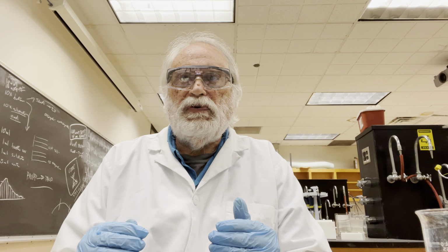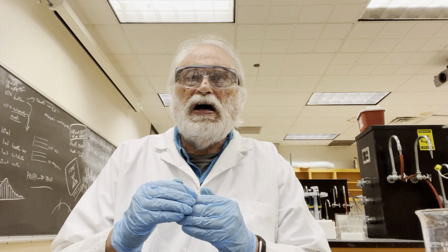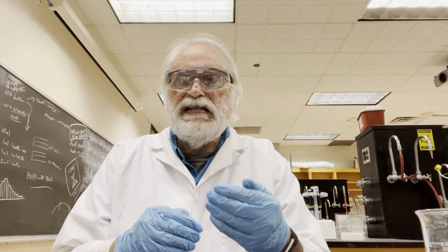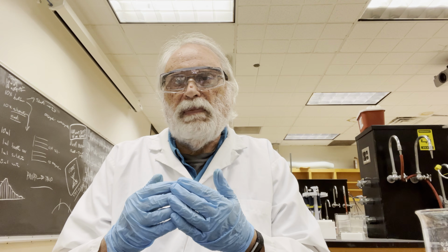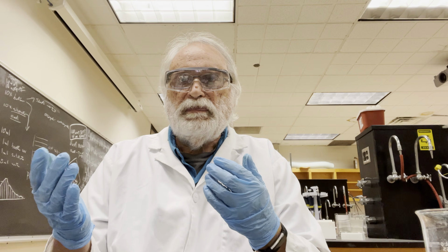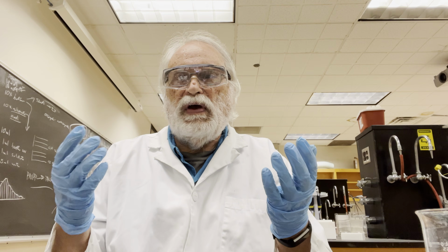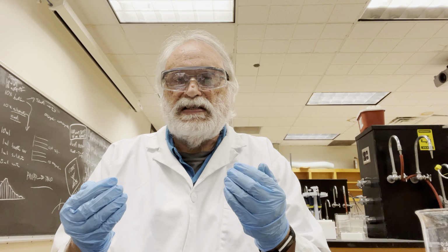Well, we want to be able to compare from sample to sample and from experiment to experiment and mutant to wild type. We'll make some assumptions that we want to look at the amount of activity there is. So we have the enzyme activity, but we're going to divide that by the amount of protein present. For example, if one culture grew a little bit more than the other culture and there's more total protein there, you might actually see more activity in that sample. But we'll divide that by the amount of protein present, and that'll normalize everything.